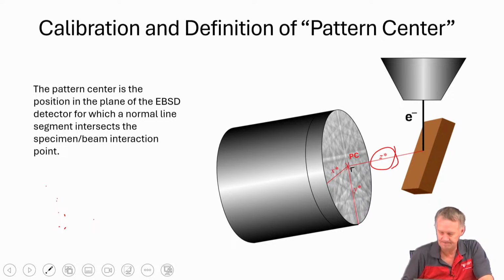There is a very nice example in the book by Henry. There's a lot of discussion on calibration. Austin Day did his entire thesis on calibration for EBSD, so there's an entire thesis showing different techniques.